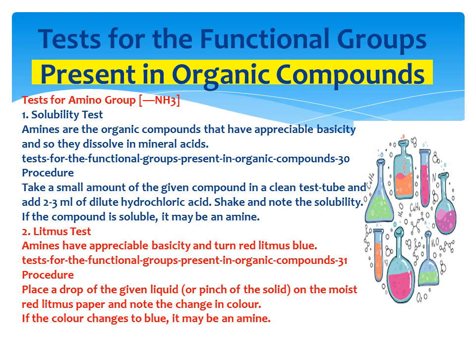Another test is the litmus test. You have to confirm its basic nature, and if it turns red litmus blue, that is the characteristic of any base. So you place a drop of the given compound on moist red litmus paper and note its color. If it changes to blue, it may be an amine.